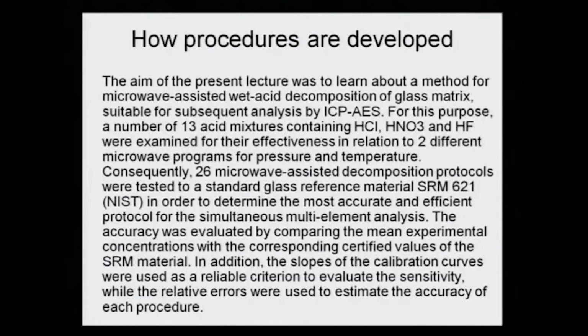The aim of the present lecture was to learn about a method for microwave assisted wet acid decomposition of the glass matrix, suitable for subsequent analysis by ICP-AES. It was felt that glass, which is the toughest to digest, needs more attention, and therefore, there should be a new method of microwave assisted wet acid decomposition. For this purpose, 13 acid mixtures containing HCl, HNO3 and HF were examined for their effectiveness in relation to two different microwave programs for pressure and temperature.